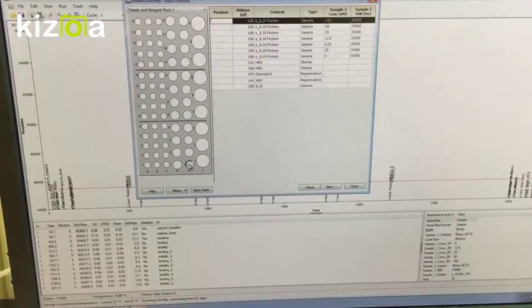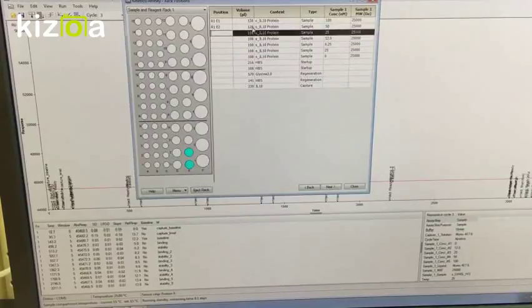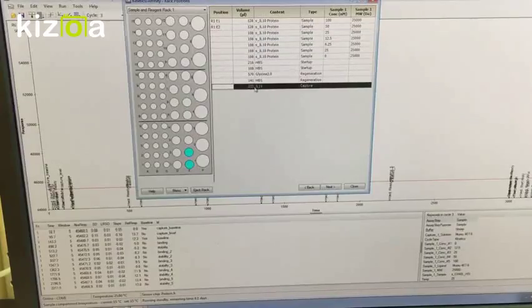So for example, this one is going to be here, this one's going to be here, and in addition to that, you know the volume needed right here. It tells you that you need 128 microliters, and this corresponds to 100 nanomolar, and this is for the soluble IL-10 protein that will be flowing through. And then the antibody of interest that we're capturing is right here, the IL-10, and you need 230 microliters.